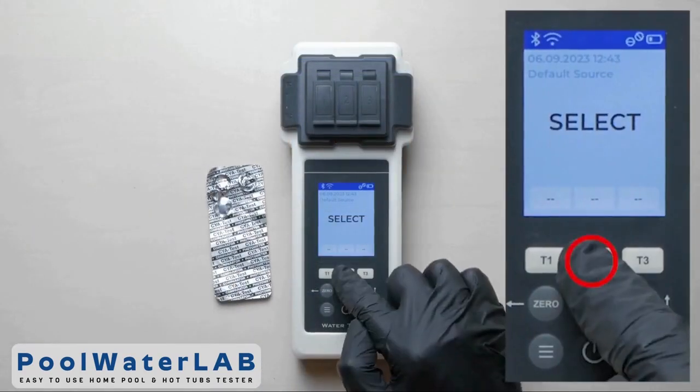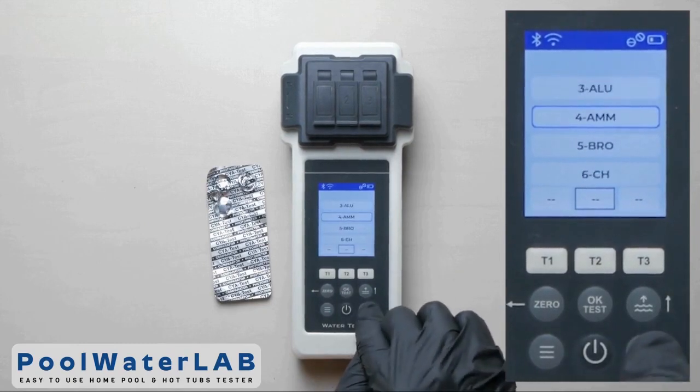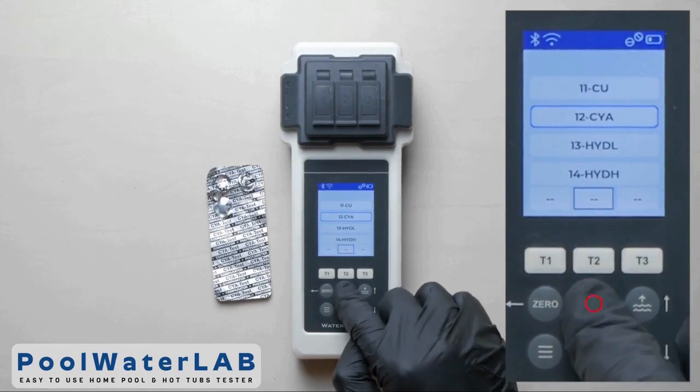Press the T2 button to go to the menu. Use the up and down buttons to select the desired parameter. Click OK to confirm the selected parameter.